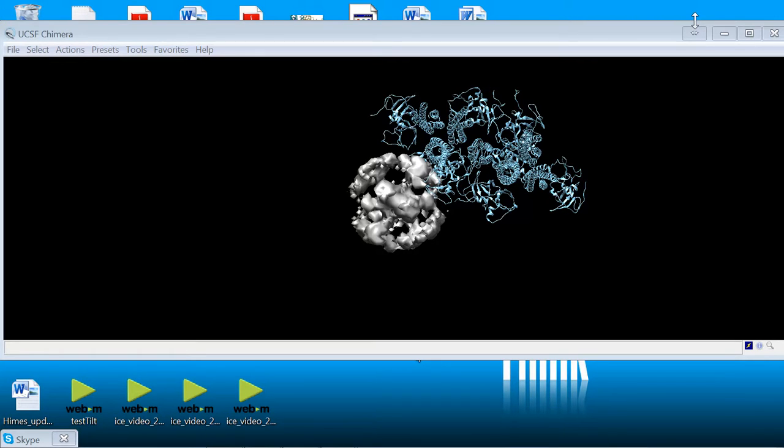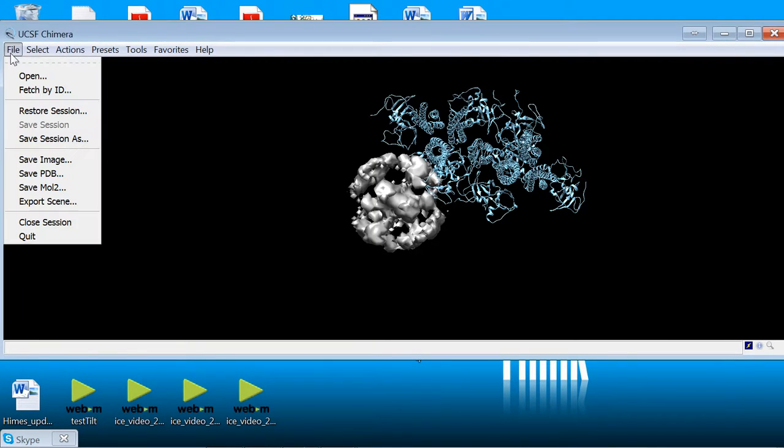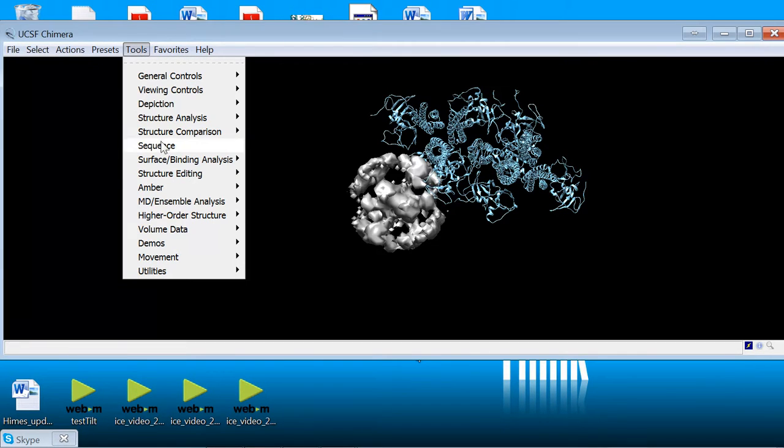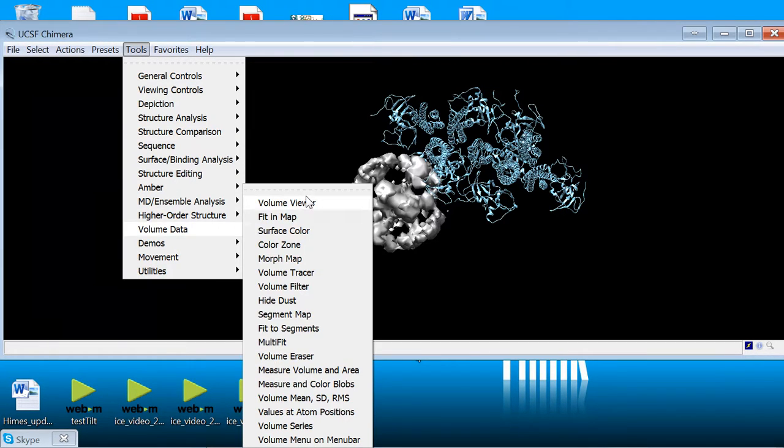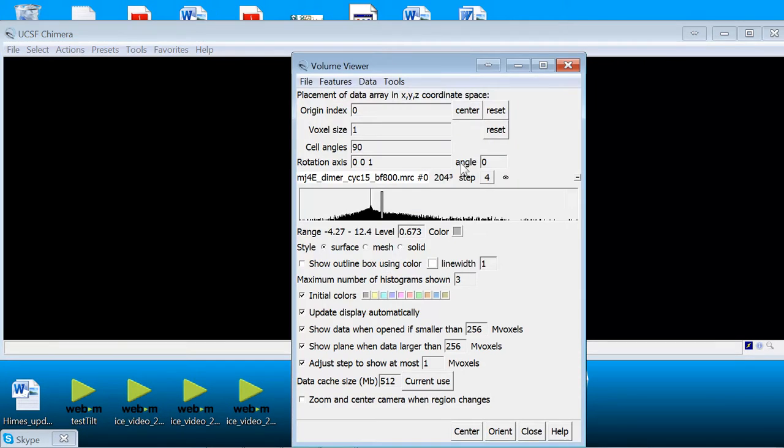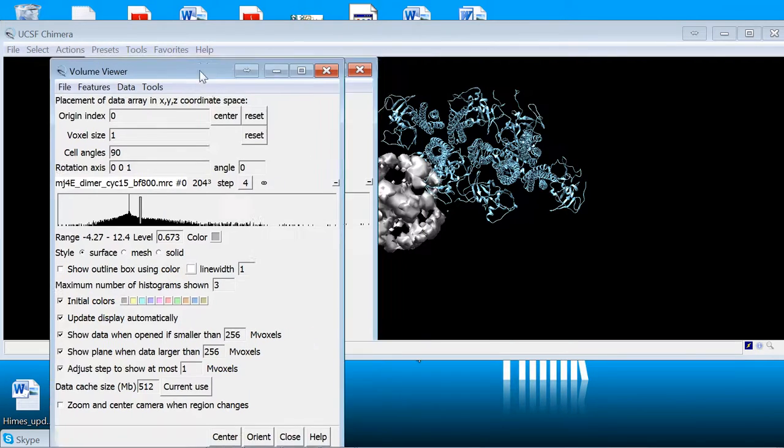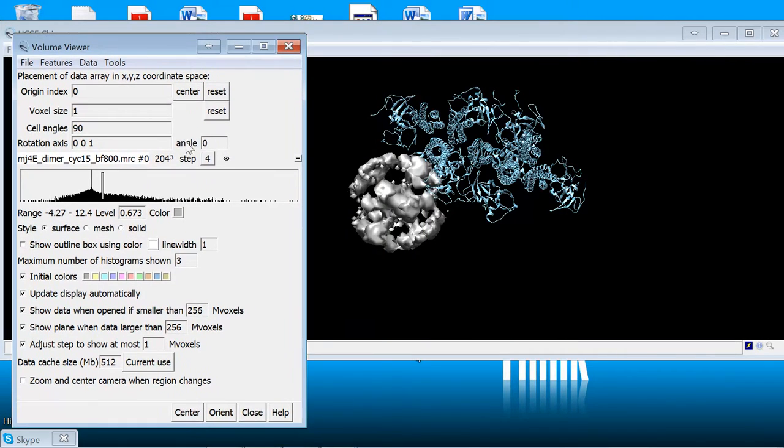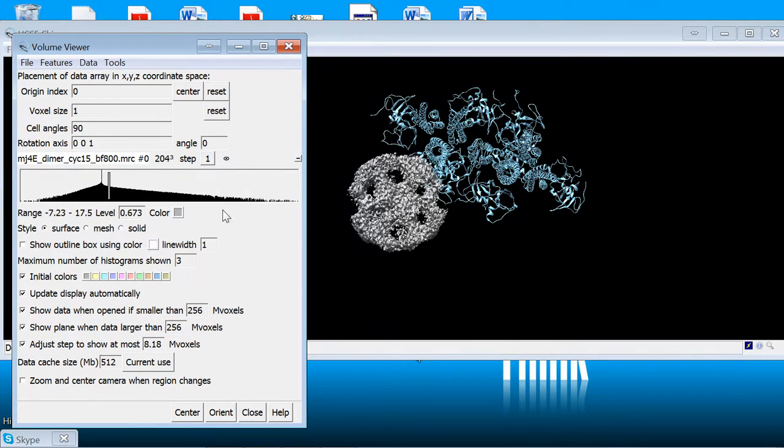So the first step is to open things up in Chimera. You can do it from the command line or just open Chimera initially and then open your PDBs from the main menu and you can go to the volume data menu in order to open your maps. So I already have a map open here and my screen is tiny so you have to look past that.